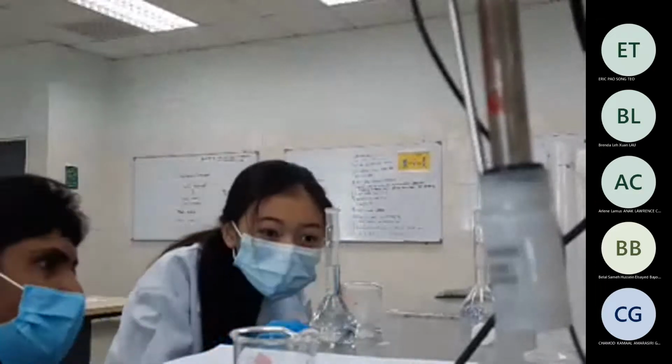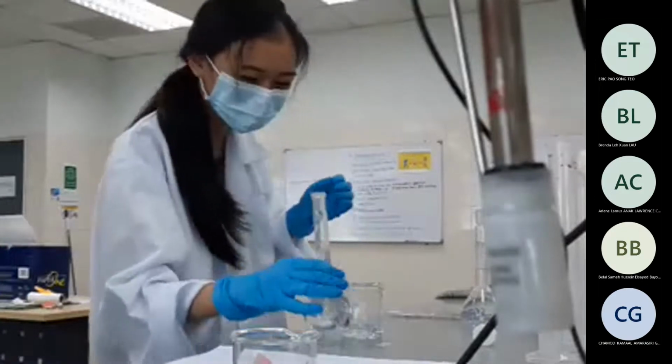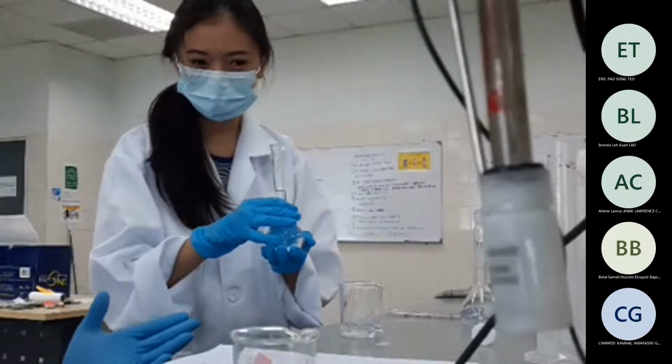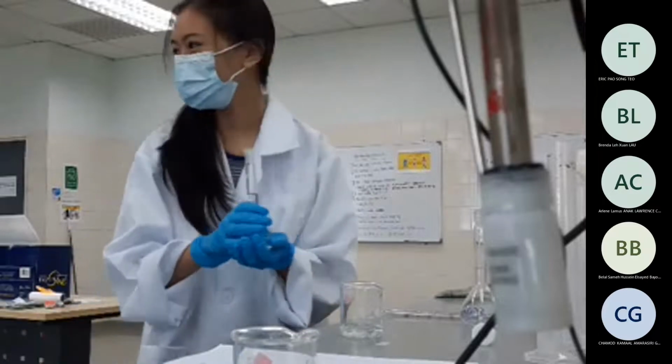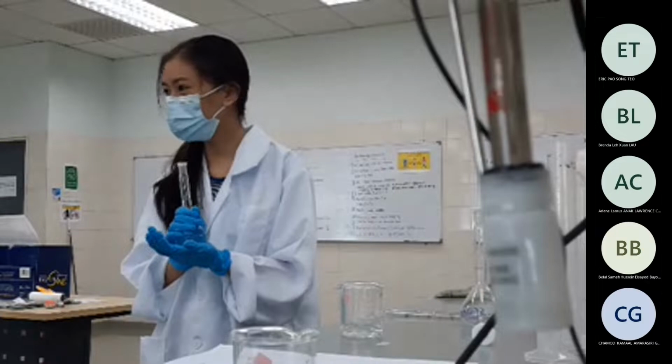Same thing for you too? It was okay, done just now, but then I poured it out. No, you cannot. You have already discarded the HCl as well, right? So you have to redo. But I thought it was close enough. No, you have to redo the whole thing, yes.